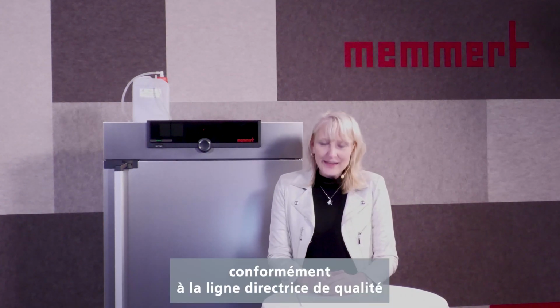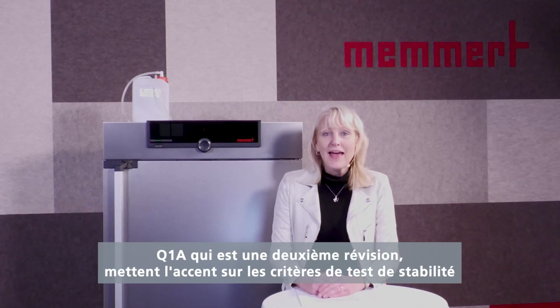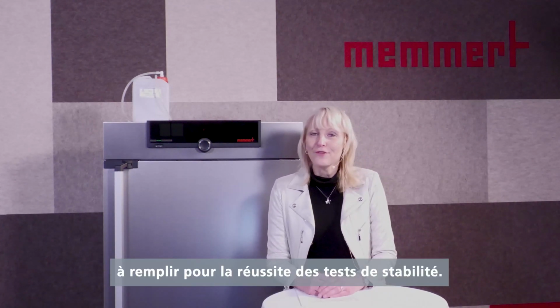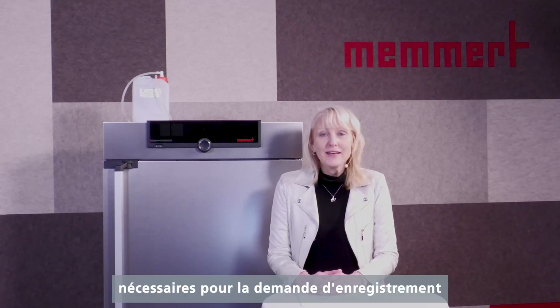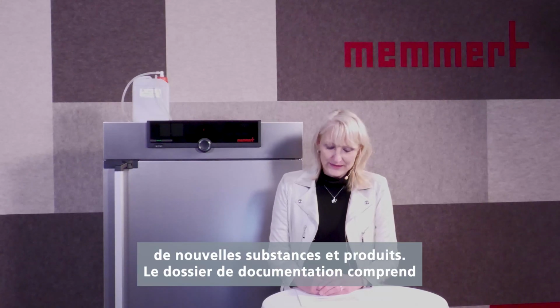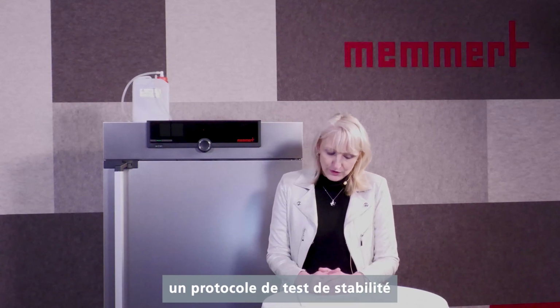Stability testing according to the quality guideline ICH Q1A, which is the second revision, emphasizes the stability testing criteria to be fulfilled for successful stability testing. Thereby, it is requested to issue the comprehensive documentation data needed for the registration application of the new drug substances and products. The documentation package includes, for example, the stability test protocol.